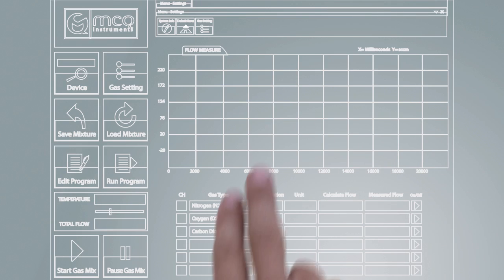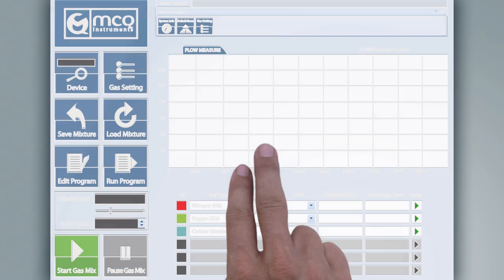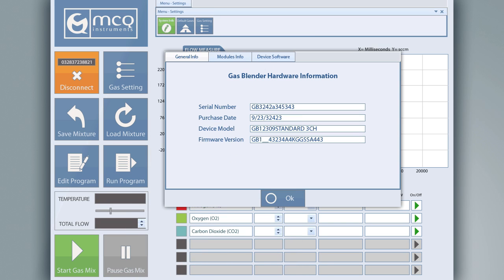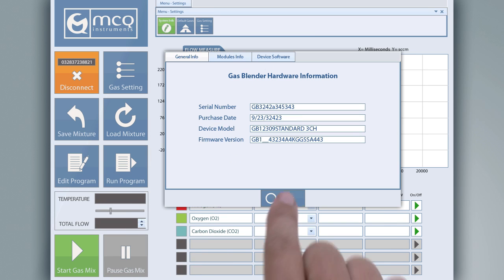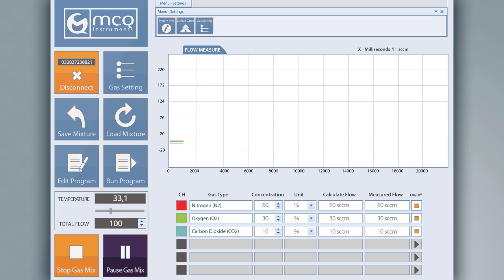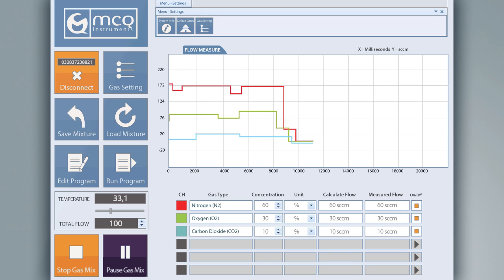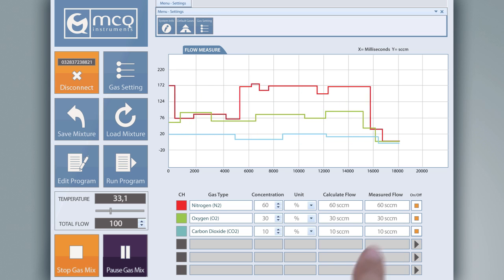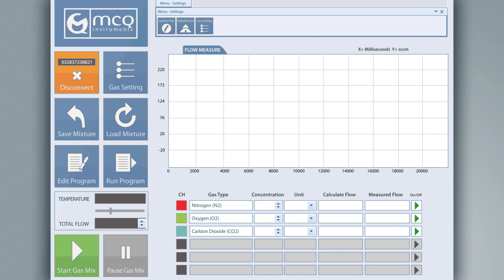MCQ Instruments offers an easy-to-use software solution developed in conjunction with extensive usability testing. The gas mixer software allows you to manage the mixing process by intervening directly on single channels to modify and control the final blending or dynamic dilution.